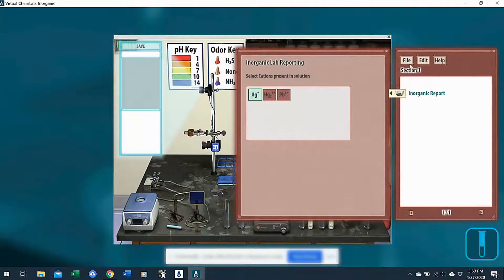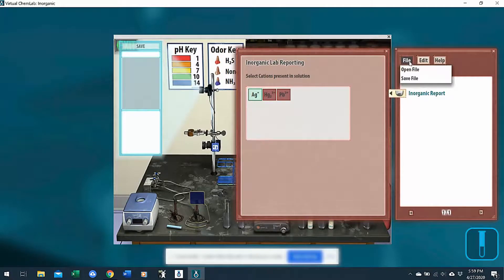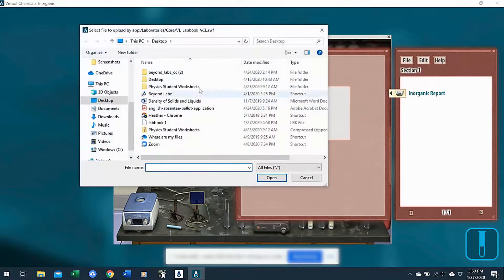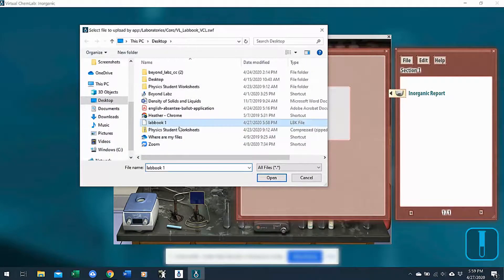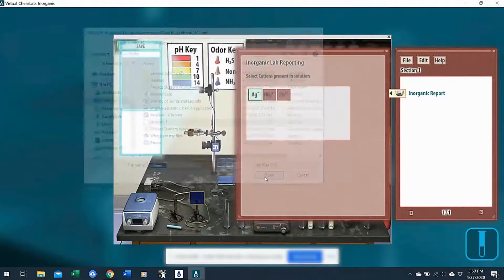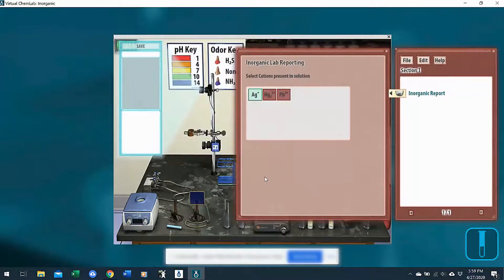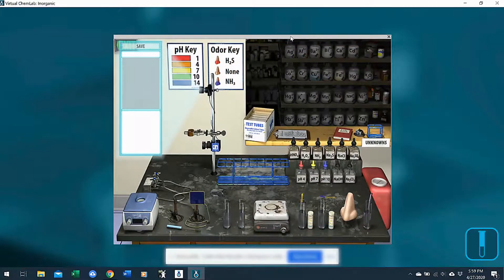On your computer in inorganic, you can click file, open, locate the file they sent you, and open it up to check how they did. Students could repeat this as many times as they need until they get them right.